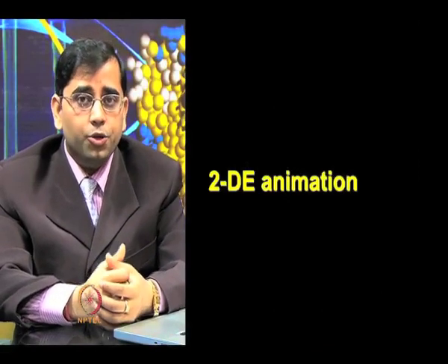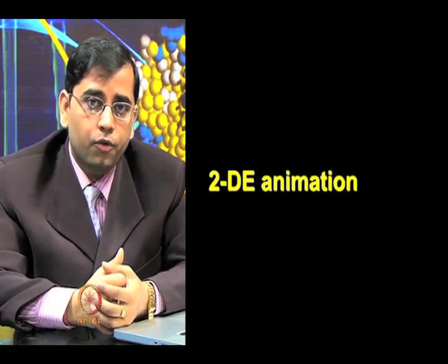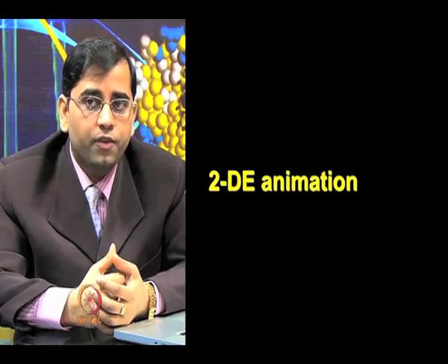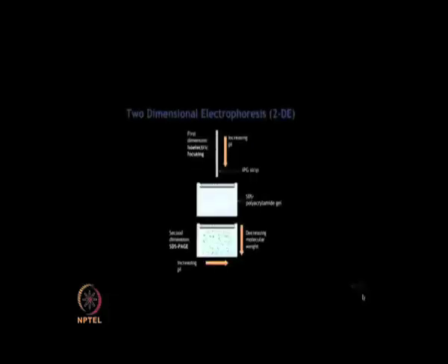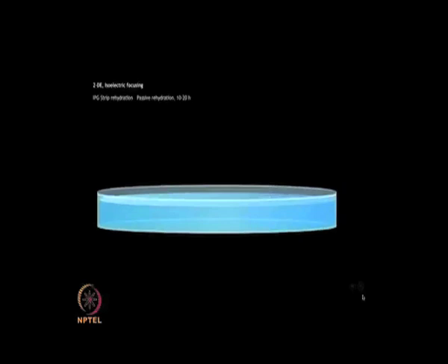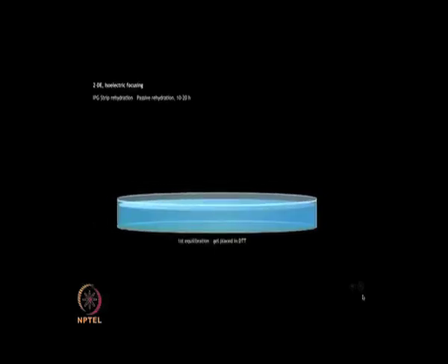So, I will now show you an animation for two-dimensional electrophoresis, which will give you an overview of the different steps involved in the 2D experiment. So, in this animation, I will describe the two-dimensional electrophoresis process. Prior to isoelectric focusing in two-dimensional electrophoresis, the commercially available IPG strips must be rehydrated. This process can be done either by passive rehydration or active rehydration.